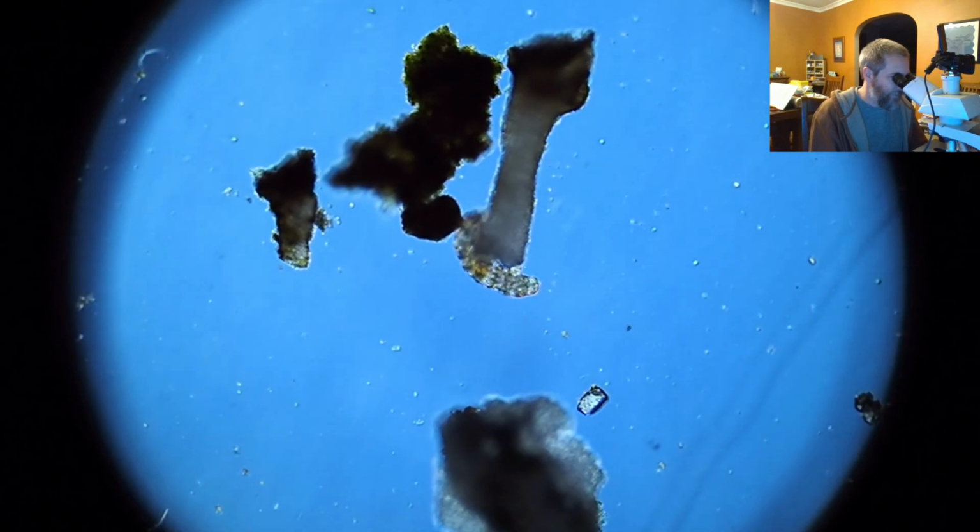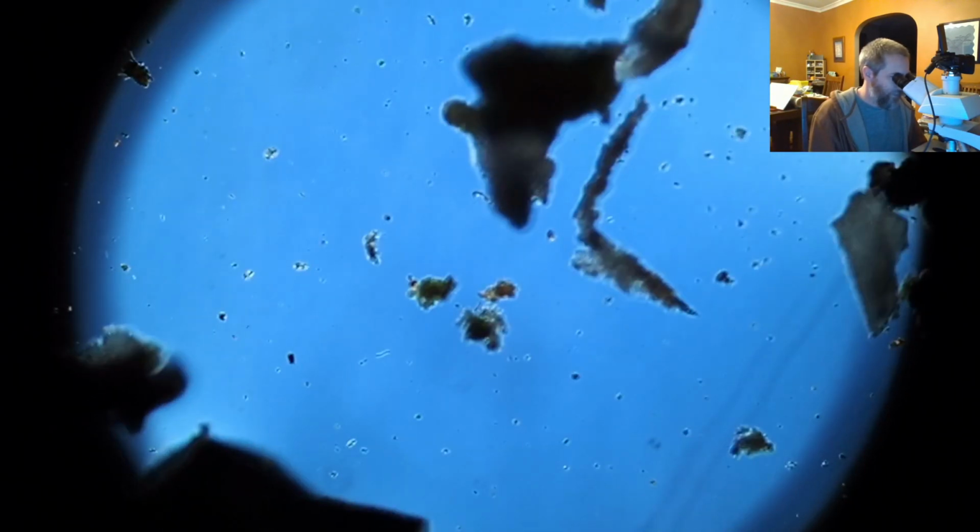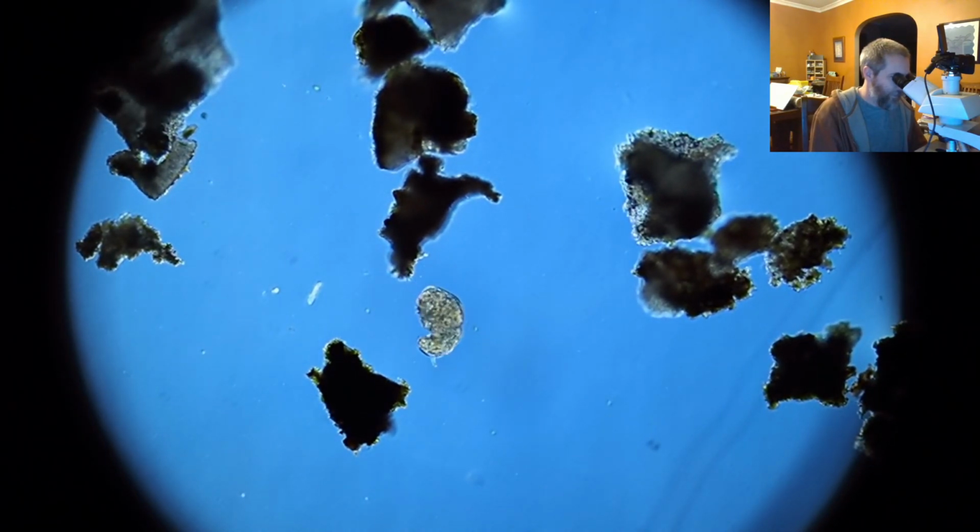Yeah, there's one big boy right here, and another one that was basically the same kind was sitting right next to it. You can see its little snout sticking out. I thought, oh, I'll just grab my camera and get it set up, and maybe they'll still be in their sleepy state by the time I start my stream. But that speaks to how fast they can come out of that state, because in the 5 minutes or so that it took me to get everything set up, when I came back to the microscope, they were already out of the field of view. So there's a little rotifer right there, spinning around. The rotifers were also still coming out of their cryptobiotic state.